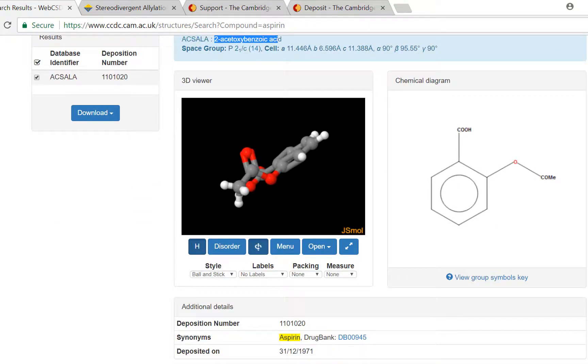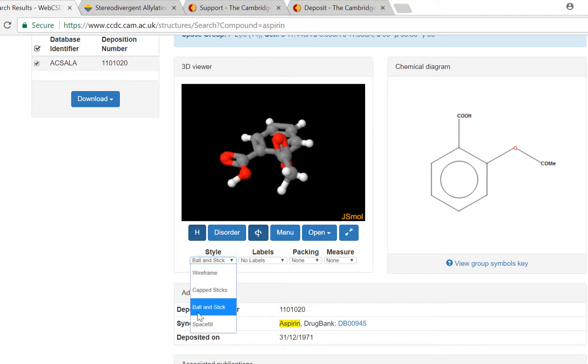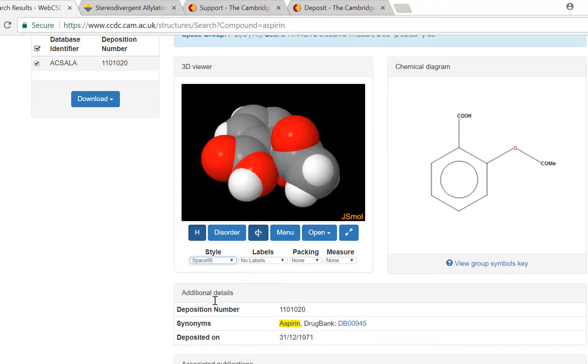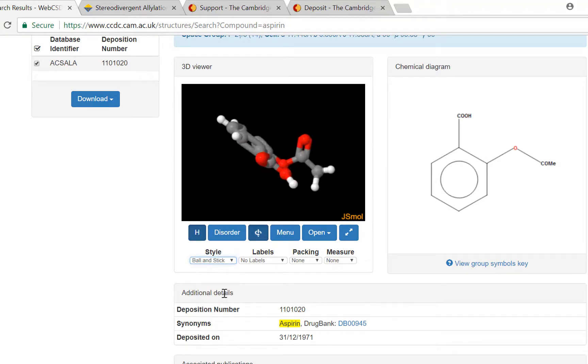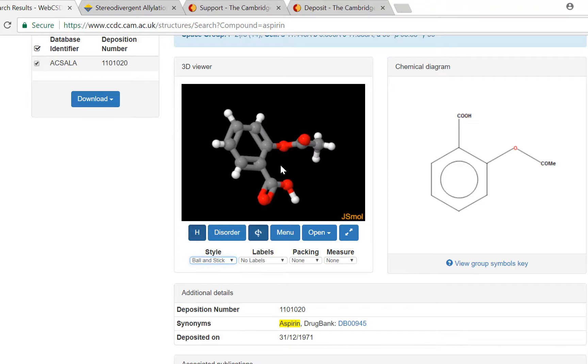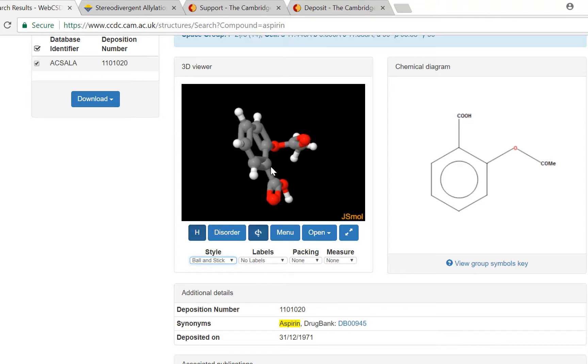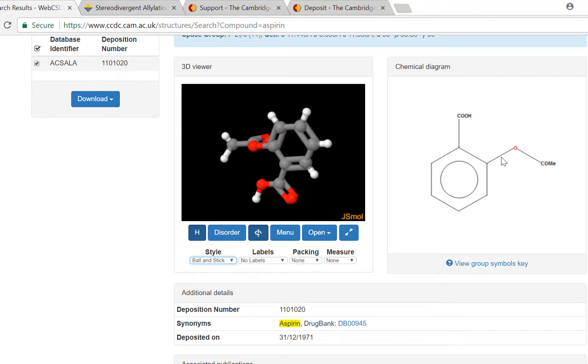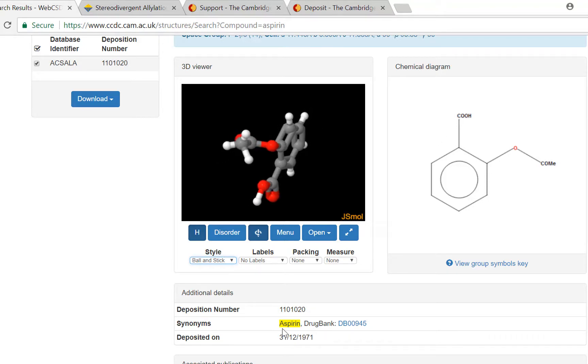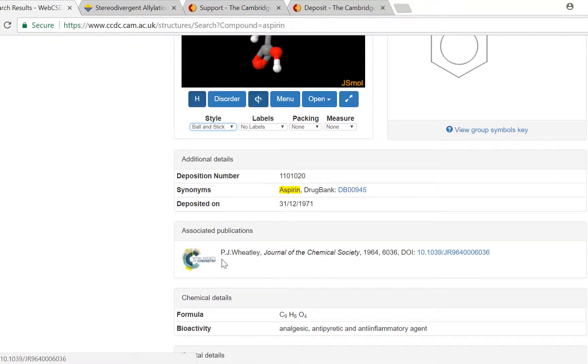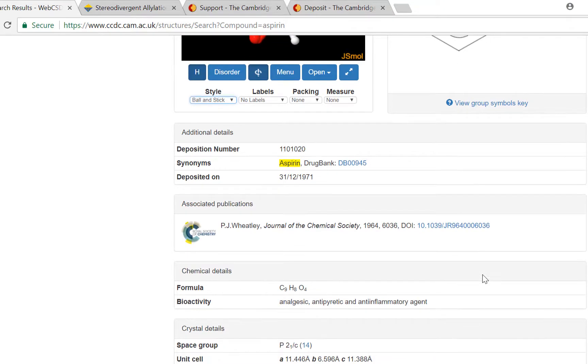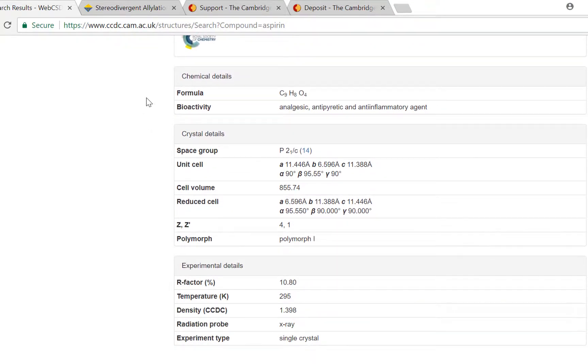There are lots of settings to play with here, so you can visualize it exactly how you would like it visualized. You can see the 2D chemical diagram, any potential synonyms, and the associated publication details along with more chemical information.